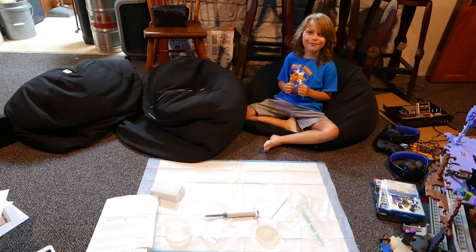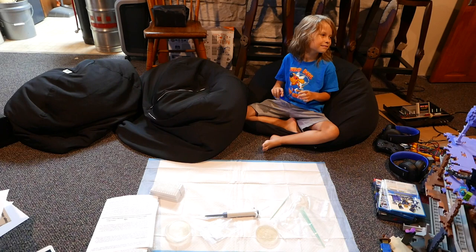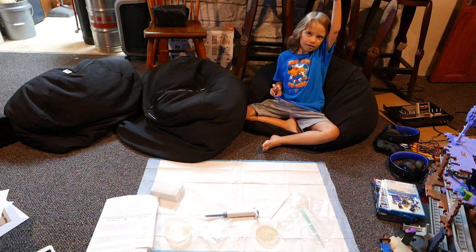While we're waiting for 30 minutes, we decided to show you what this looks like under the microscope. Are yours going to throw the microscope off it? No, we'll slide the camera around over here somewhere. Correction — Danny will.